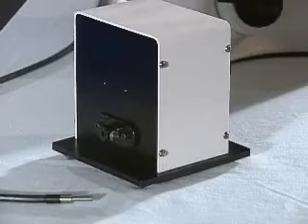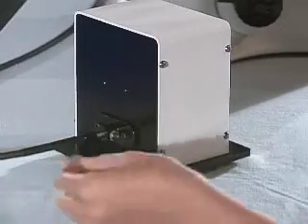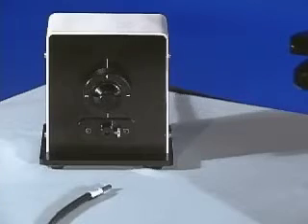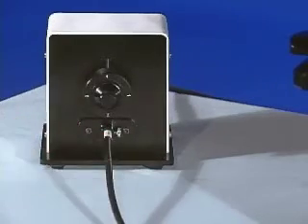To set up the system, take the light guide from the light source and fully insert it into the rear port of the modulation unit, and gently tighten the thumb screw. Next, fully insert the light guide from the CytoViva adapter into the front port of the modulation unit, again gently tightening the thumb screw.